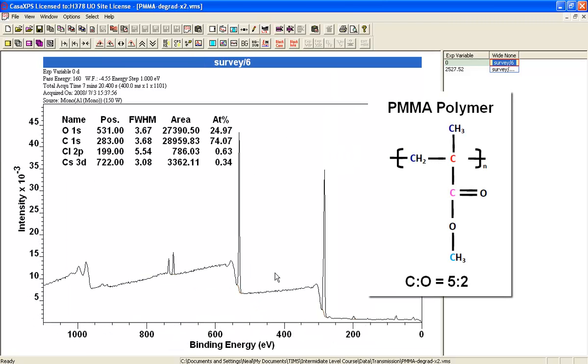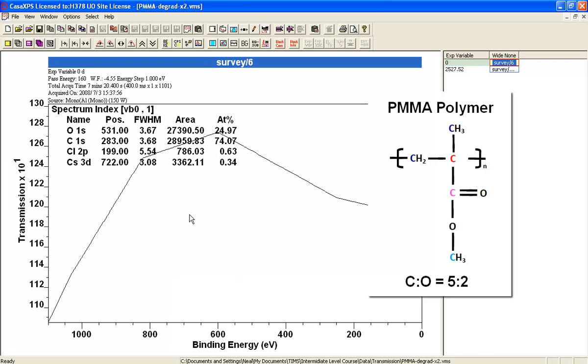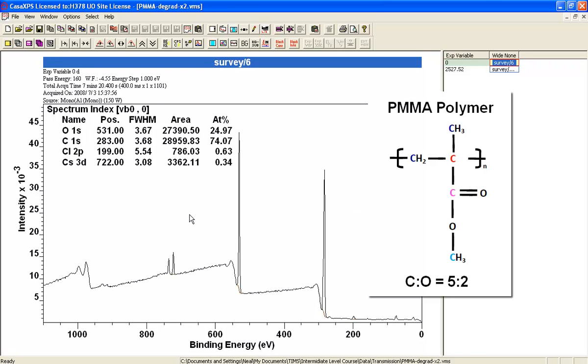Based on the quantification with the element library as delivered and other factors used to scale such as the transmission, we've got a ratio here of 1 to 3 and we're expecting 5 to 2.